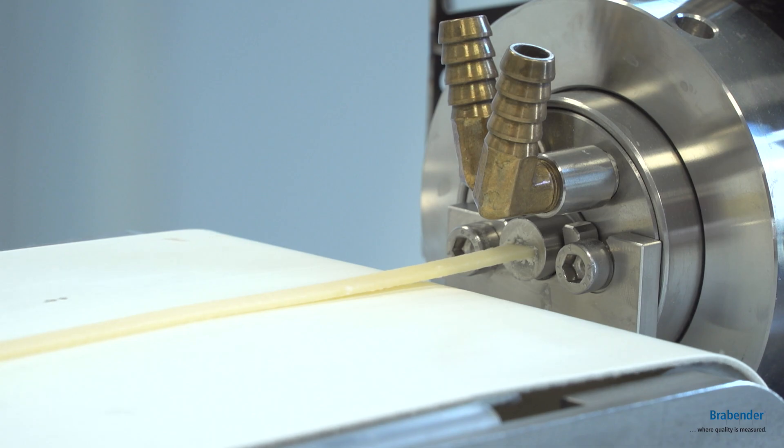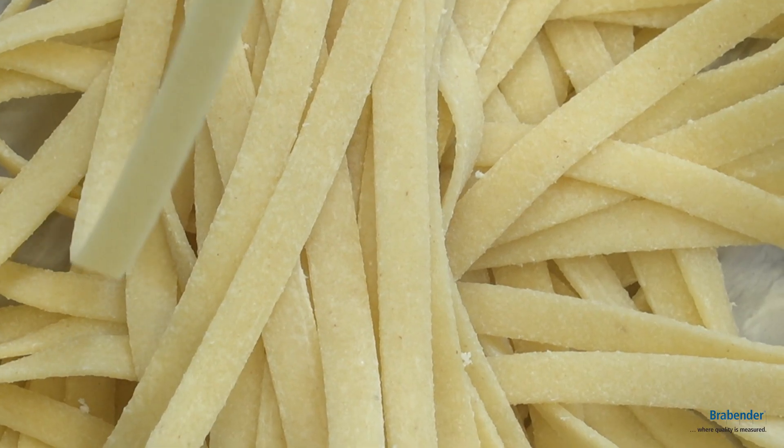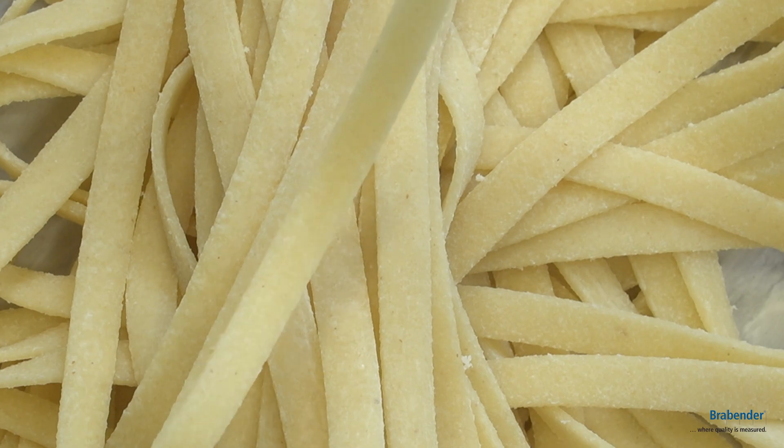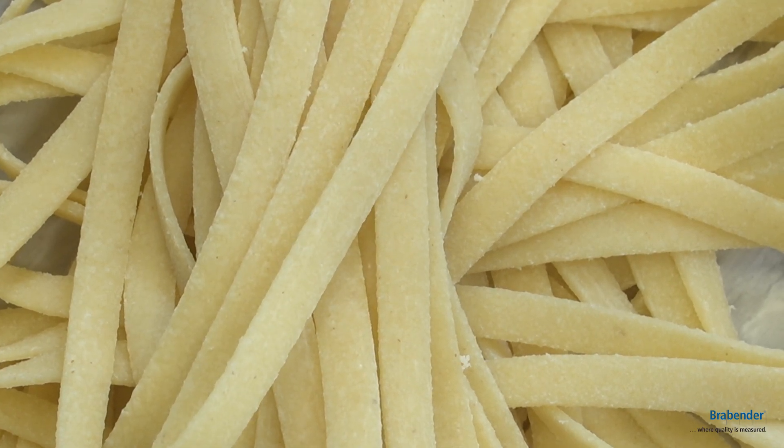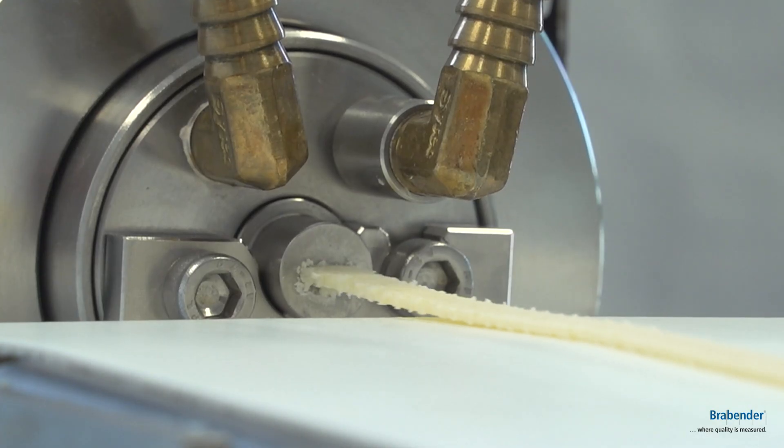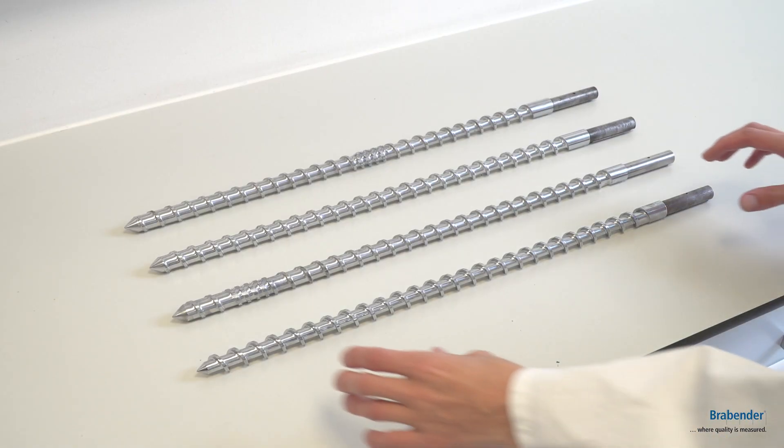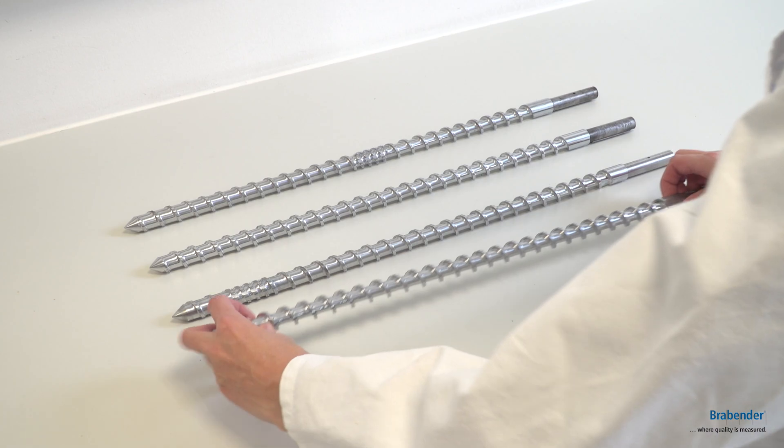By using the KE19, the quality and processability of raw materials and material mixtures can be controlled under different process conditions. With a screw diameter of 19mm and a length of 25D, the extruder is designed for producing small quantities of up to 10kg per hour.